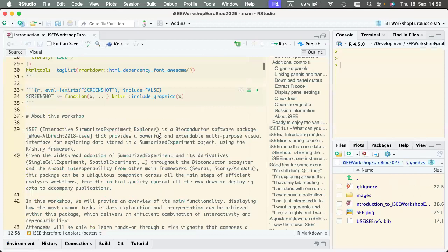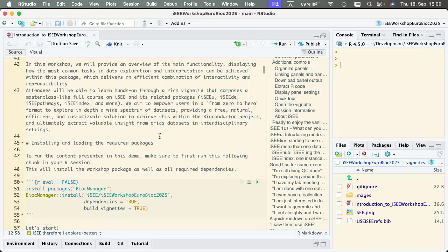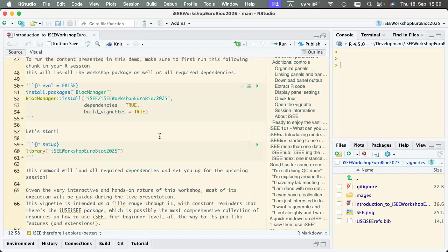Okay. Let's say I would take up the invitation, or the nudge, from Helena yesterday in her keynote speech. She said, let's go back to basics. What type of plots do you normally use when you do single cell data analysis? UMAP. So what's a UMAP plot? It's a scatter plot. Okay, we have it. What else? Box plots. Okay, so something like a feature across some categorical variables or across a continuous one.